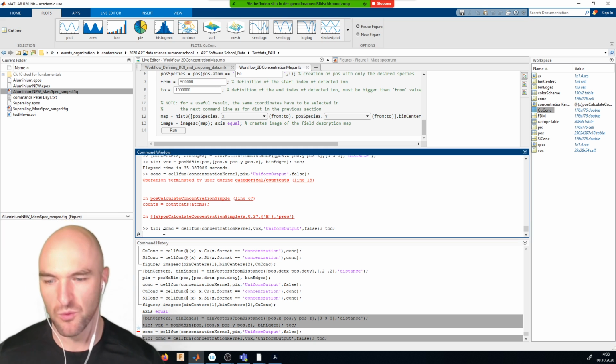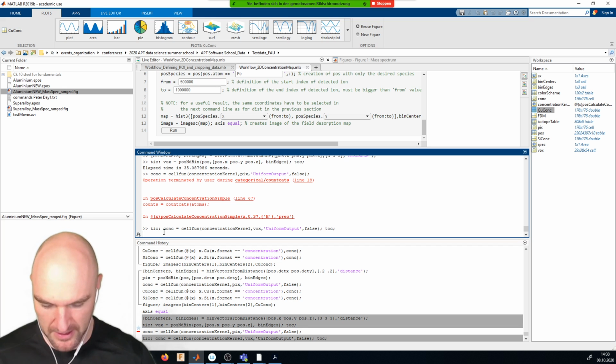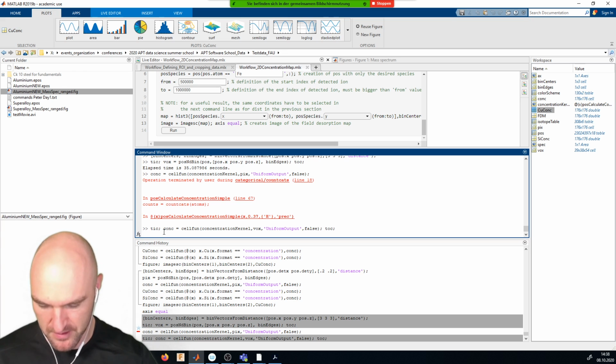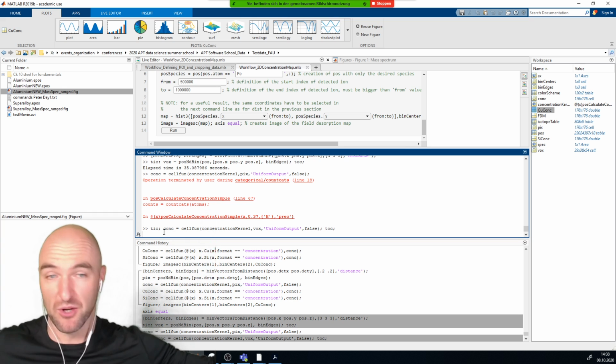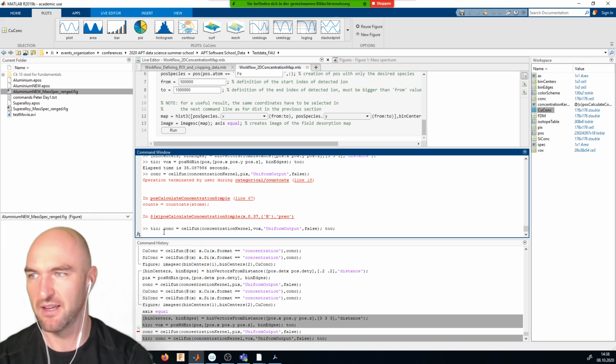Which also brings us to one of the upsides of having scriptable things. Most high-performance computing centers at universities have licenses for MATLAB high-performance computing servers. So all of those scripts you can just send over to your high-performance computing center and have them running on however many cores they're willing to give you. Very often you can get 100 cores, you can get 200 cores.